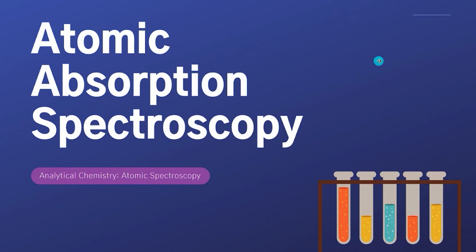Hello everyone, my name is Jordan and welcome to the first video in a series of video lectures regarding the methods for atomic spectroscopy. Now in this particular video, I will be focusing on the key concepts, theories, as well as the applications for atomic absorption spectroscopy.